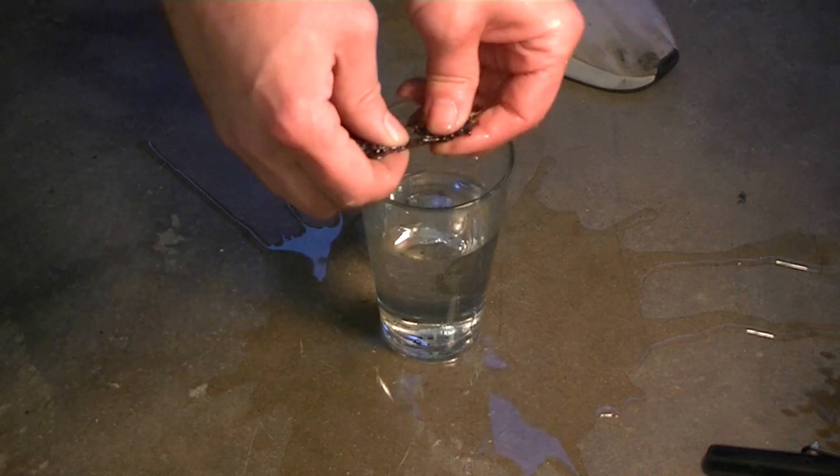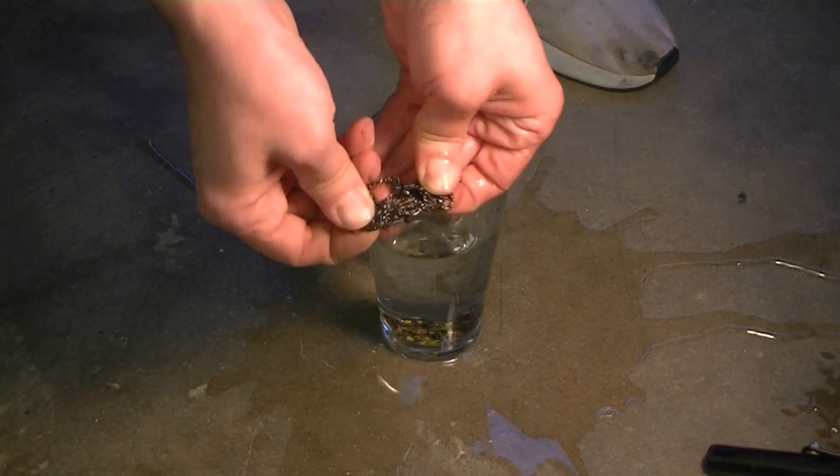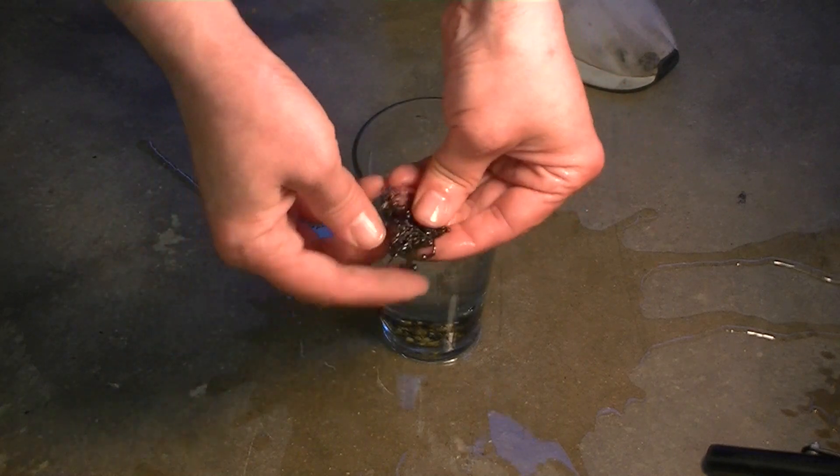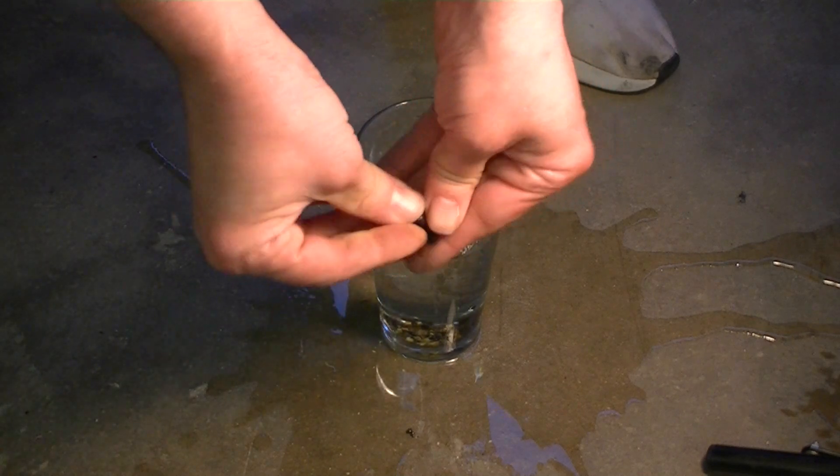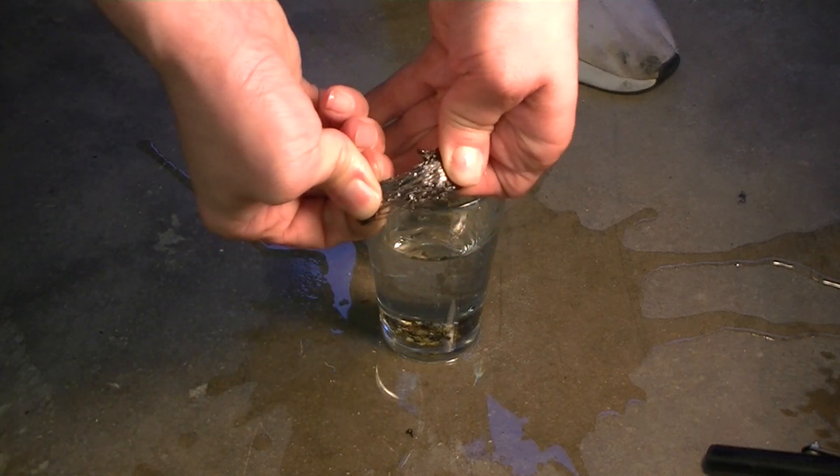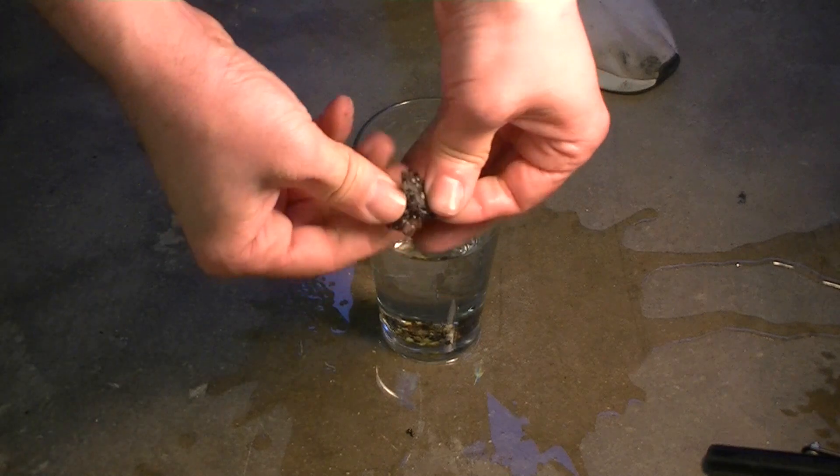When we remove the sulfur from the water and pull it between our fingers, you can see it has a chewing gum or rubber-like consistency. Although sulfur has almost zero solubility in water, I still wouldn't recommend chewing this.